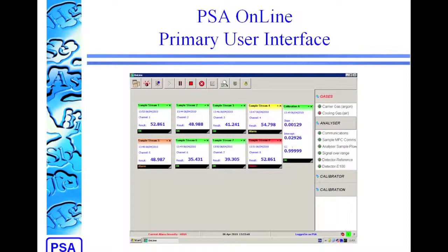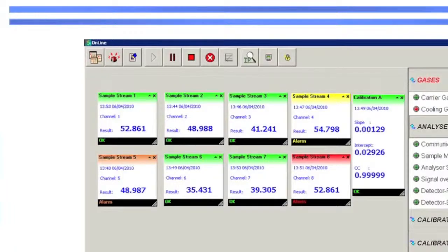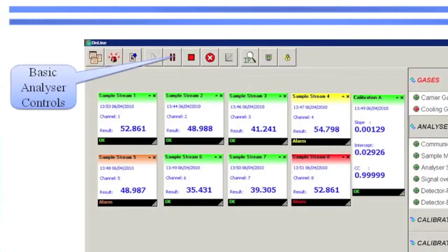First of all, we'll look at the primary user interface, or main page, and there are three different sections that are of particular interest on this page. First of all, we have the basic analyzer controls, where you can start or stop the instrument operating.